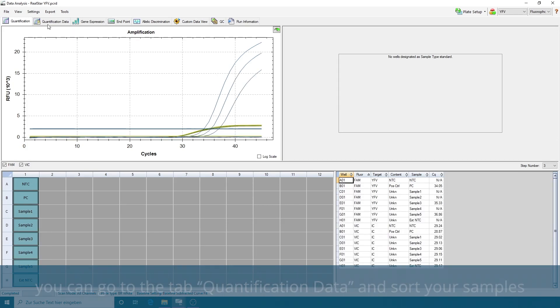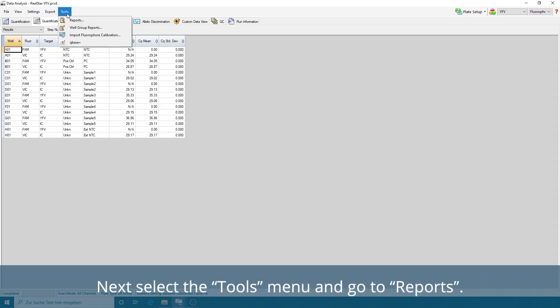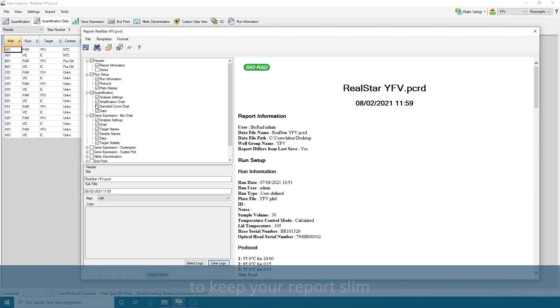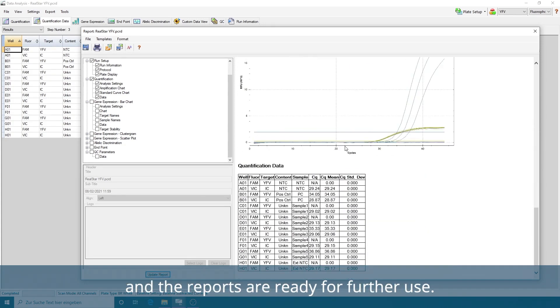If you want to create a result report, you can go to the tab Quantification Data and sort your samples and detection channel order to your liking. Next, select the Tools menu and go to Reports. The Report Generation window will open. On the left-hand side, you can unselect all the unnecessary data to keep your report slim and include only the information important to you. Now your PCR test results are complete and the reports are ready for further use.